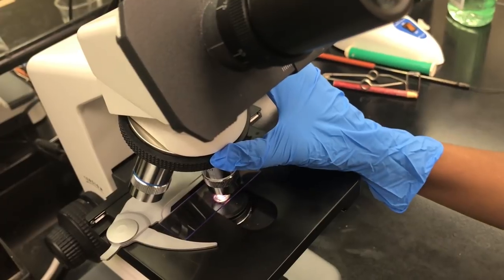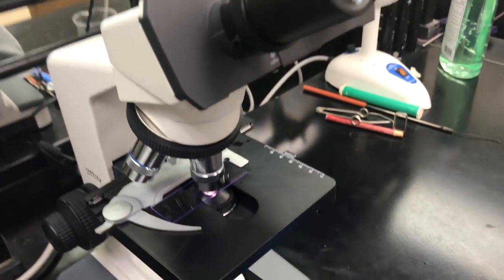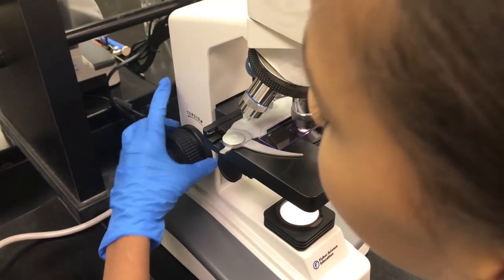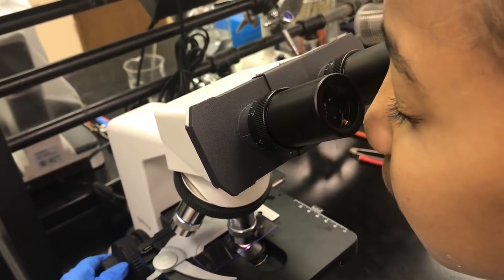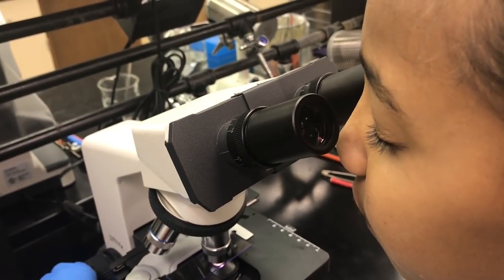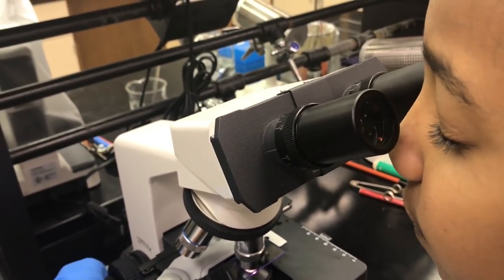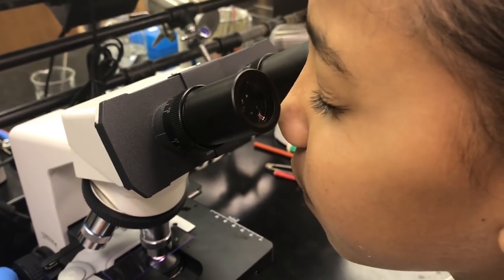It's not going to hit it. Okay, and then you use the fine adjustment knob only. The small one, yes. Slowly move it until it comes into view. Is it coming into view? Move it in the other direction if it's not coming into view.